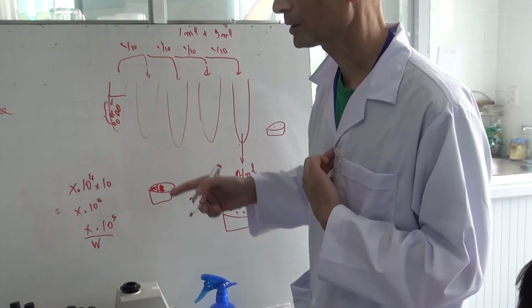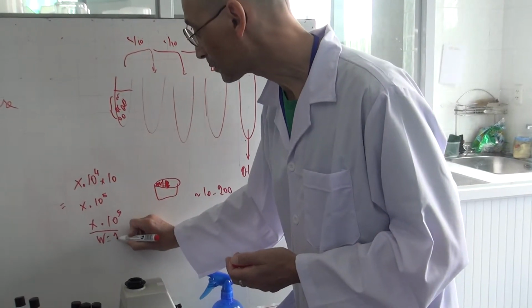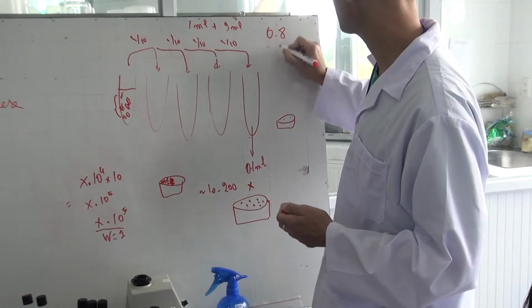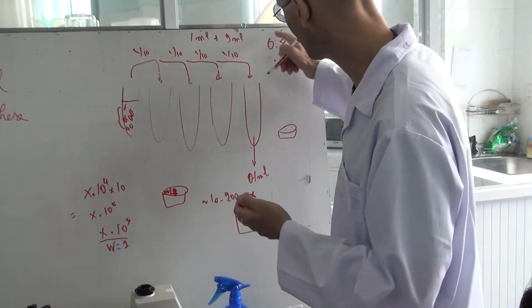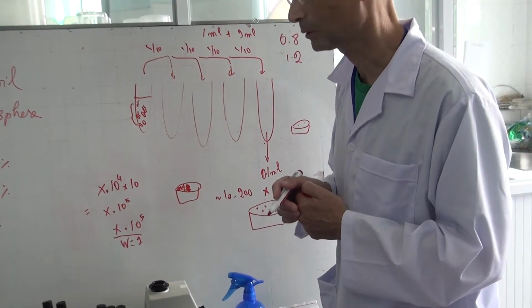In our case, we have, let's say, 1 gram. So it's divided by 1, it's very easy. But if I had, like you remember, we said sometimes you have 0.8, sometimes you have 1.2, sometimes you have 2 grams, sometimes you have 0.5. So you have to weigh it and divide by the weight.